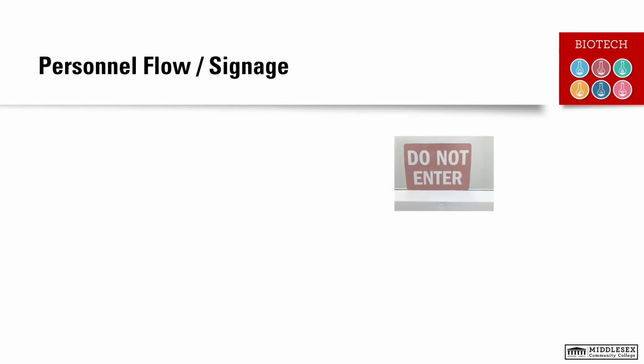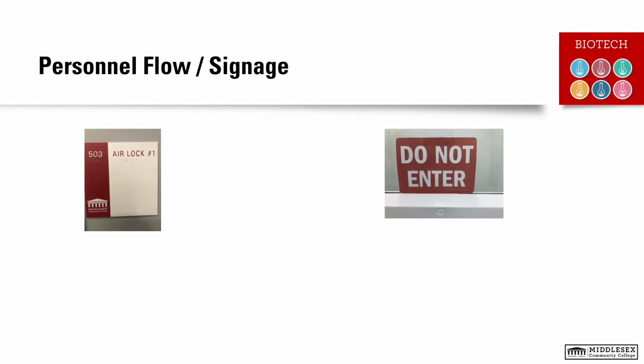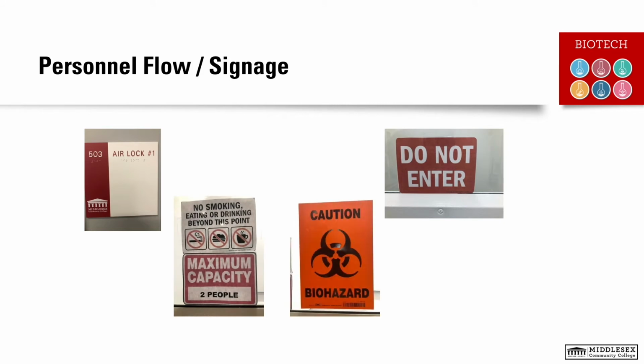We should always pay attention to signage when working inside of the clean room or accessing the clean room environment. Personnel flow maps are located on the walls prior to entering inside the clean room as well. Personnel movement is a factor designed to eliminate or minimize contamination in the clean room. If a sign says "do not enter," we should not enter for the purpose of minimizing contamination.